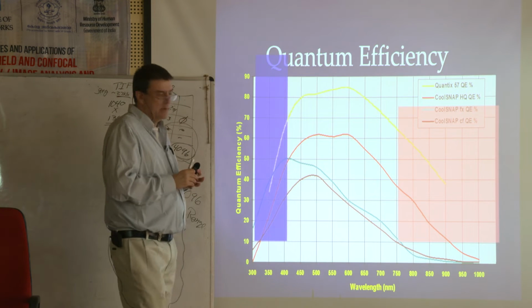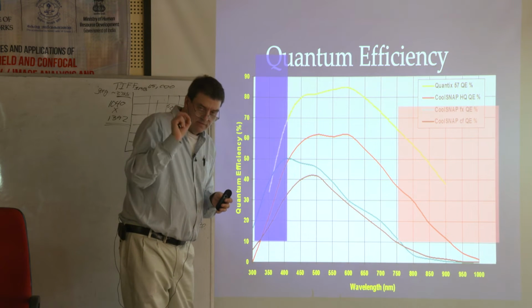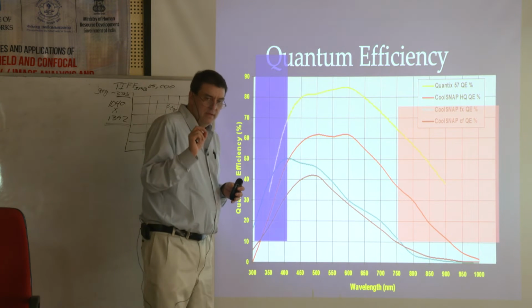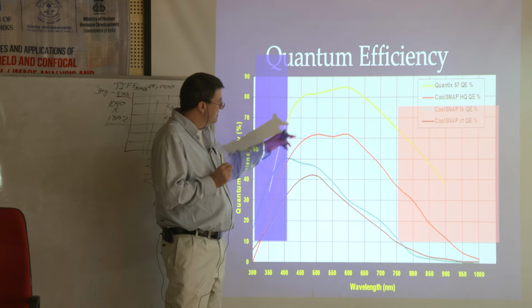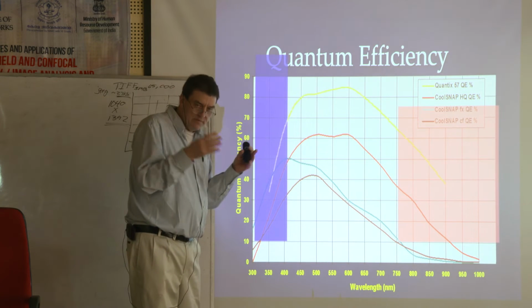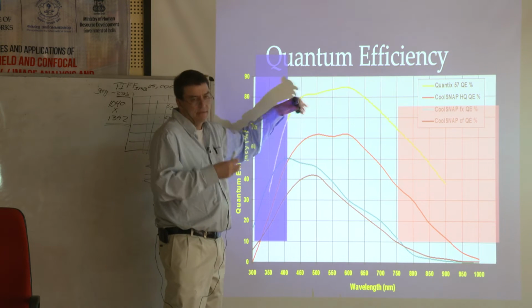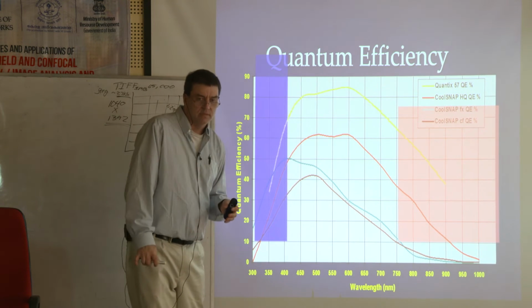Well, he was using a camera, probably like this, because he was trying to detect this very, very little level of fluorescence. And he wanted to go very, very fast. So he had to get as many of the photons as he could. He couldn't waste photons. He had to grab every photon he could grab because there were so few being made that he needed a camera that could bring all the photons in.